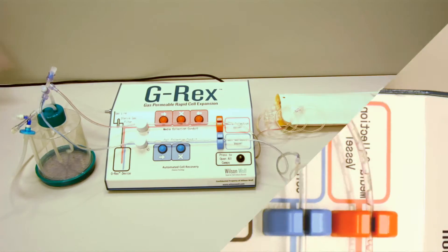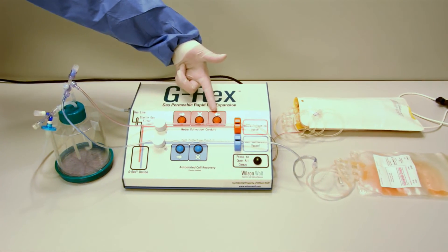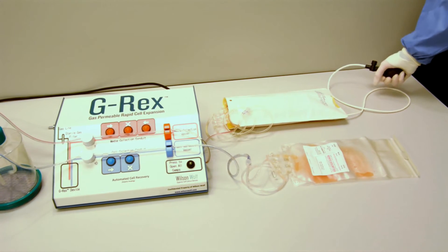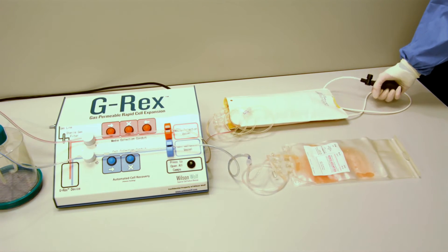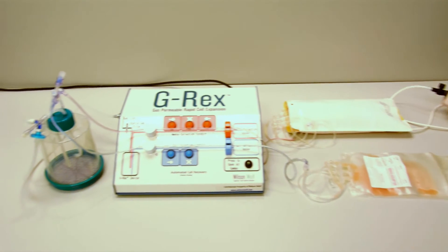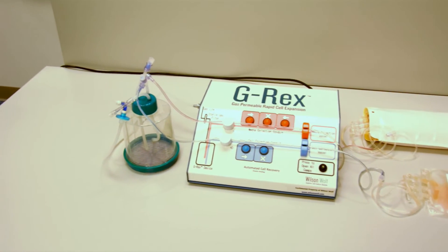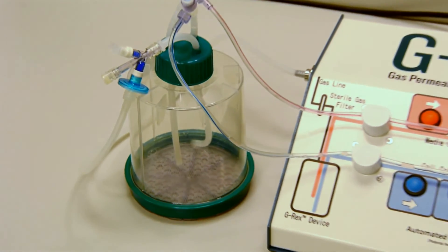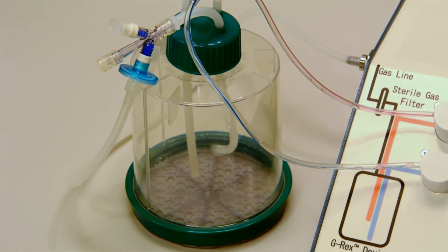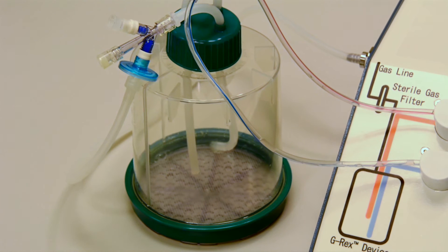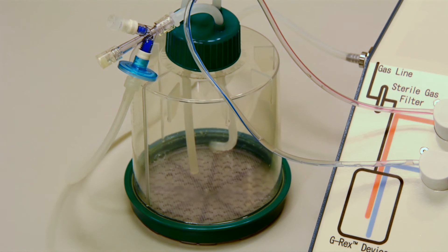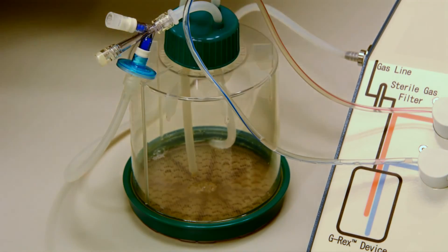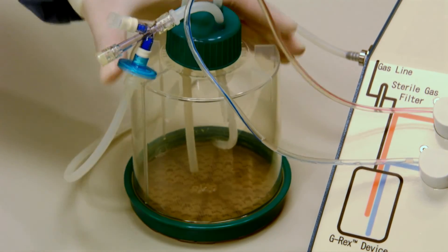At this point, since this is a closed system, we can press this button to release the media line clamp and direct some excess media back into the G-REX using this aqua press. We can use this media to rinse the flask and recover any residual cells in the flask and cell line.